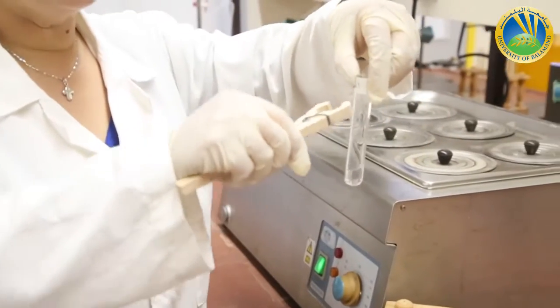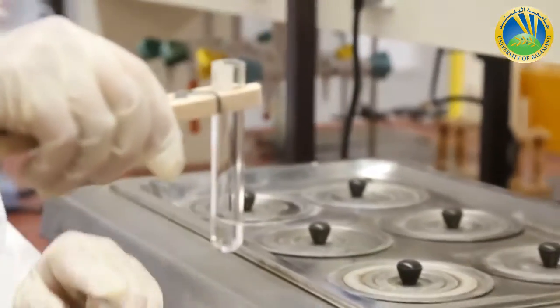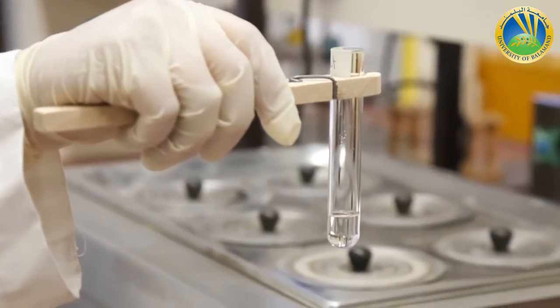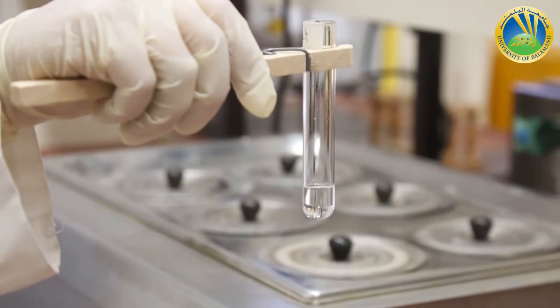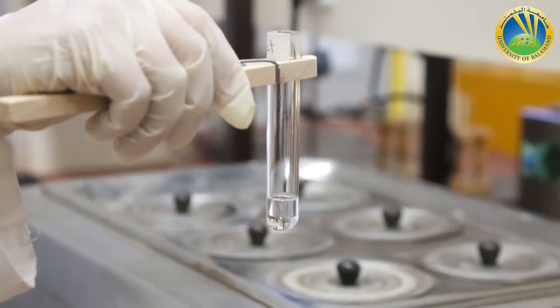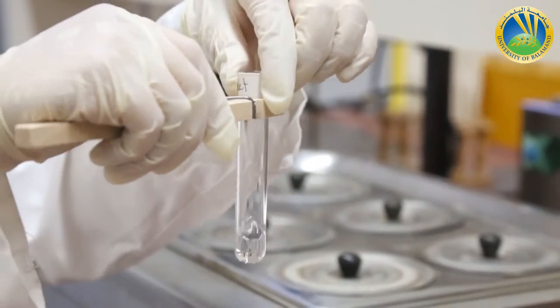We have tested all our compounds inside water and we noted the results. Now we are going to test the solubility of the same 5 compounds, but this time using the solvent acetone. I'm going to start with the acetanilide inside acetone at cold. I see no more granules of acetanilide inside acetone at cold, so it is totally soluble at cold.